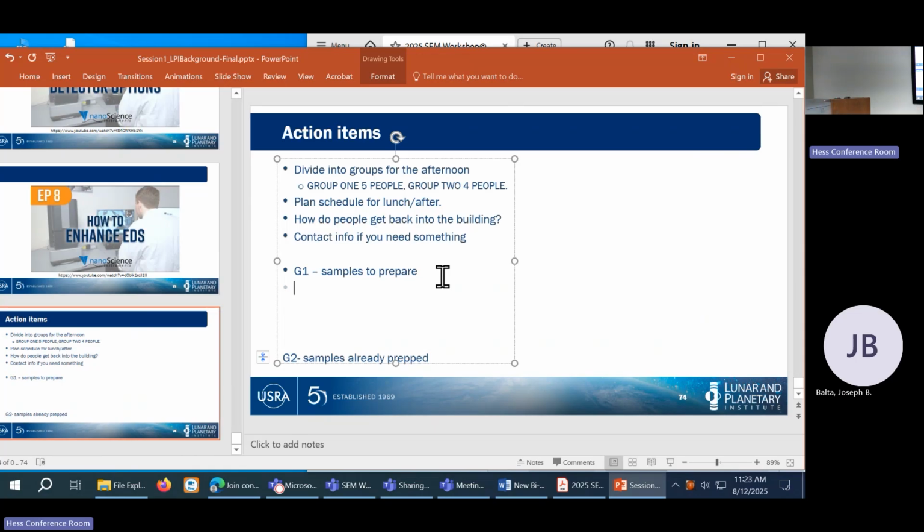Let's have her start off with the group that's on the SEM this afternoon. And that way, if it turns out that we're having a lot of difficulty getting even an image of this, we can then go into this in the sample prep and think through that in the morning. Okay. I like that plan.